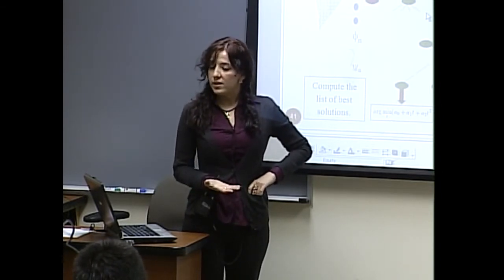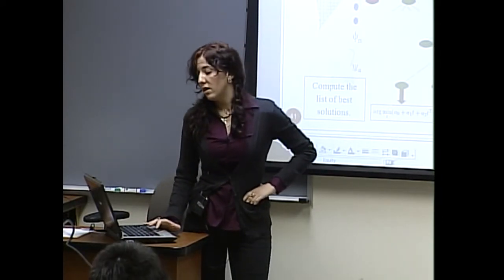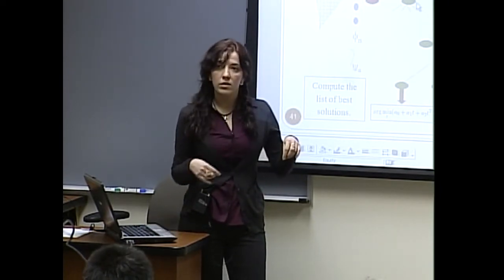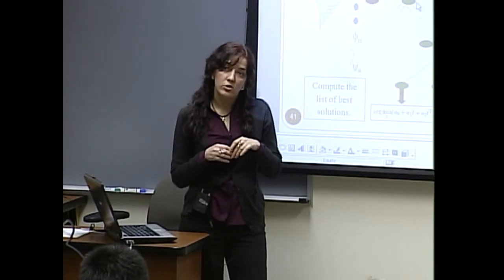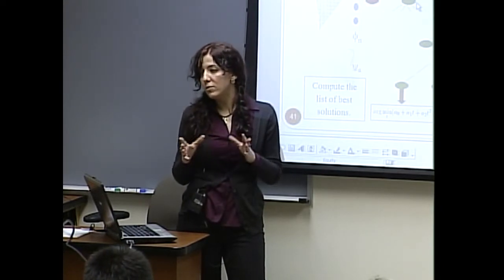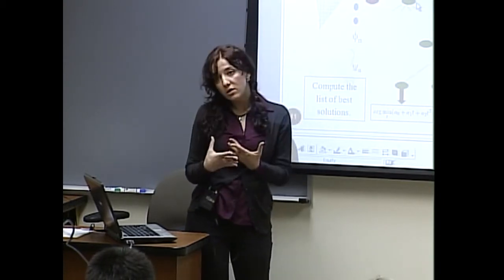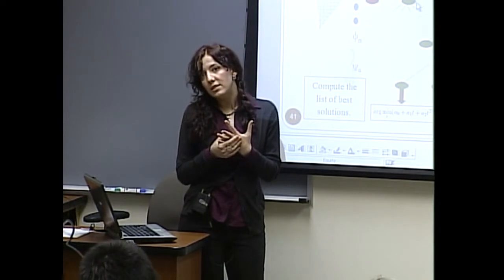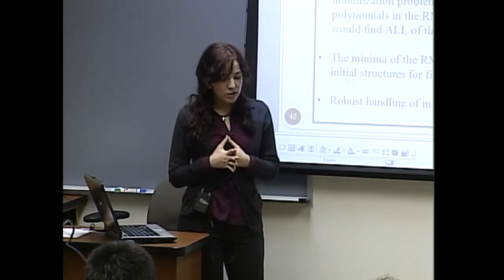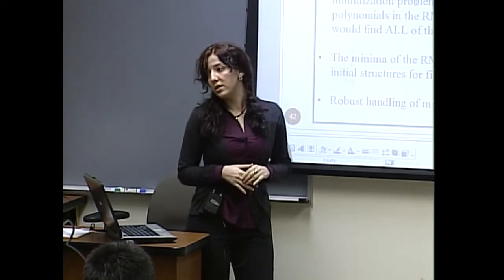However, we do not have perfect data. So these three ellipses will not intersect in one point. We will have to use minimization, but the estimated structures in the tree will be close enough to the intersections of this function with zero if the data was perfect. Therefore, we have very good starting points for further local minimization. So that's the argument that we are using in our approach.